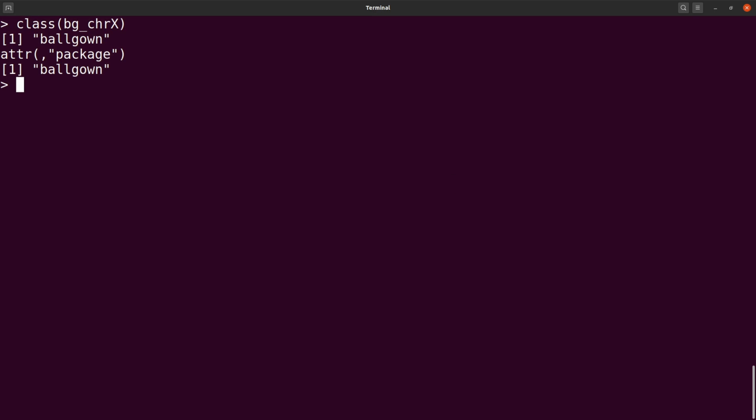Now let's proceed and do some queries. We can say bg_chrx just to give us some description. So we have 3971 transcripts. And remember, we also used a command previously to get the total number of transcripts, and so Ballgown has also confirmed that for us here.